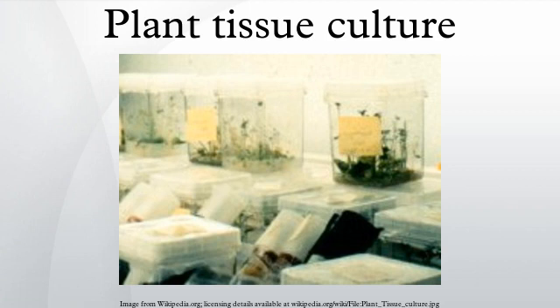As cultures grow, pieces are typically sliced off and transferred to new media to allow for growth or to alter the morphology of the culture. The skill and experience of the tissue culturalist are important in judging which pieces to culture and which to discard. As shoots emerge from a culture, they may be sliced off and rooted with auxin to produce plantlets which, when mature, can be transferred to potting soil for further growth in the greenhouse as normal plants.